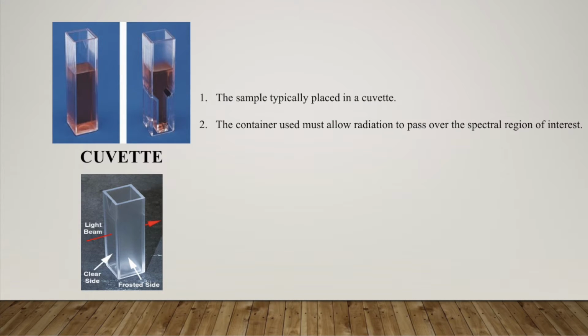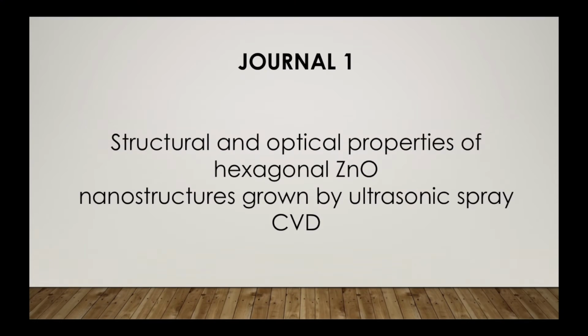The cuvette must be rectangular and the internal width is within 1 cm. The test tube also can be used as the cuvette. The widely applicable cuvette is a fused silica or quartz glass because it is transparent throughout the UV.